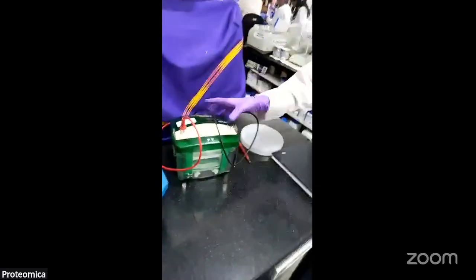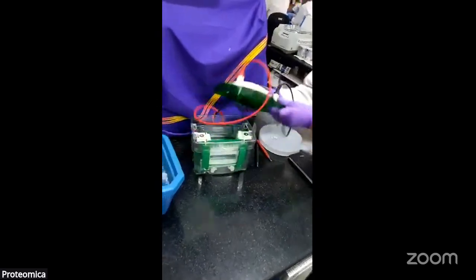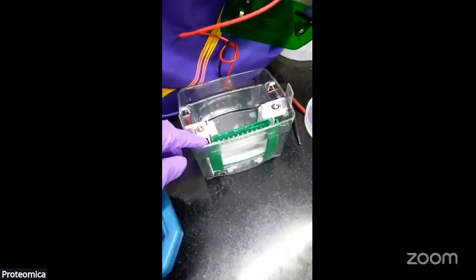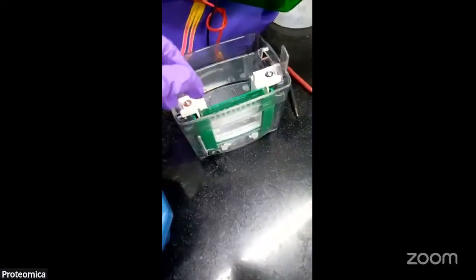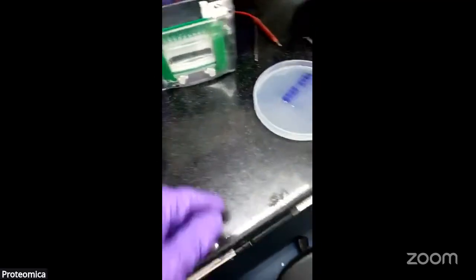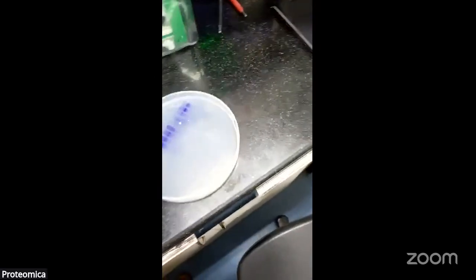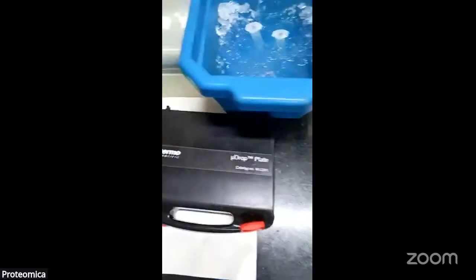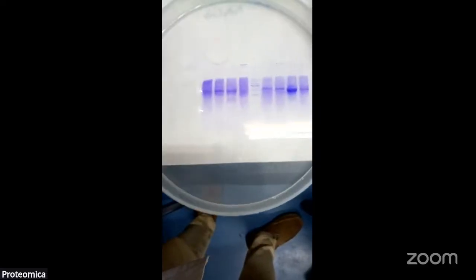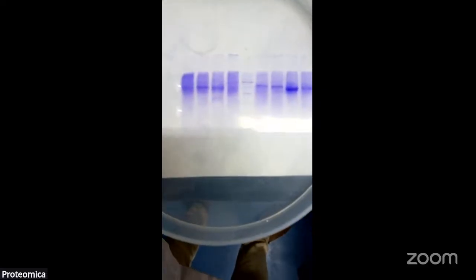This is the SDS gel apparatus that we standardly have. We put the gels inside. This is a gel piece which is placed inside. You just take out the comb, and we can load 10 microgram of the proteins. You can go for replicates, triplicates or duplicates, to show how the gel looks. This is the perfect blend of gel which comes.